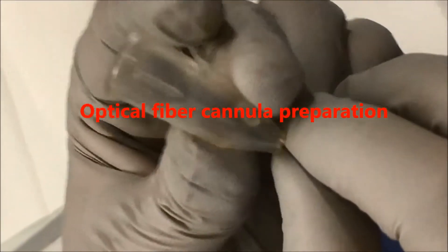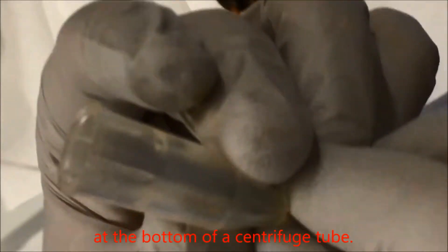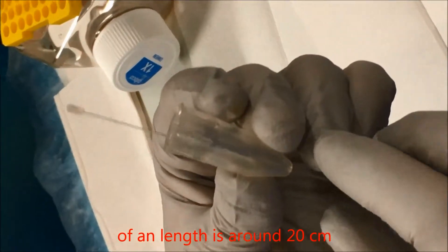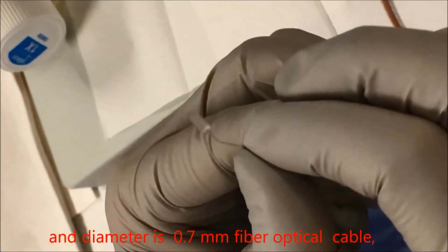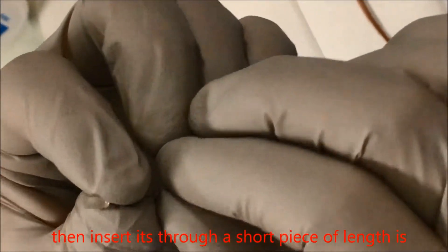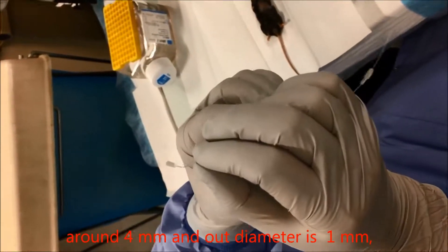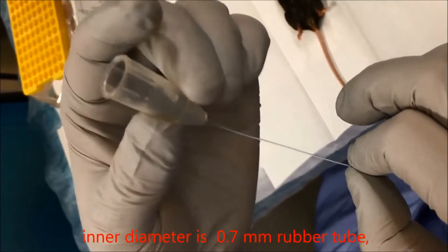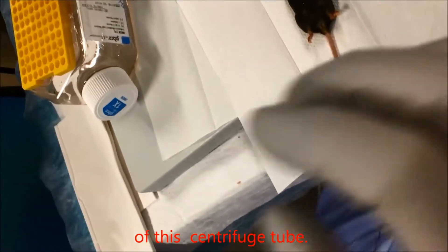Optical fiber cannula preparation. Using a small needle, make a hole at the bottom of a centrifuge tube. Insert it into one terminal end of a fiber optical cable approximately 20 centimeters in length and 0.7 millimeter in diameter. Then insert it through a short piece of rubber tube, approximately 4 millimeters in length with 1 millimeter outer diameter and 0.7 millimeter inner diameter, to fix this end tightly at the bottom of the centrifuge tube.